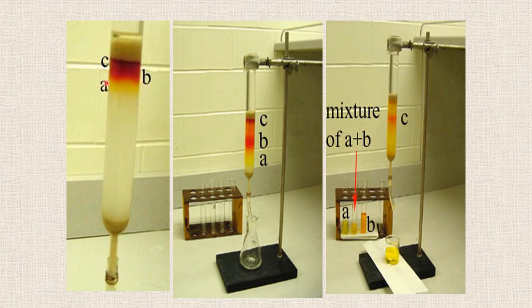Here is another diagram. In the start, these three components are very close to each other. With the passage of time, the separation takes place. The component A is eluted first, and then the B, followed by the C.